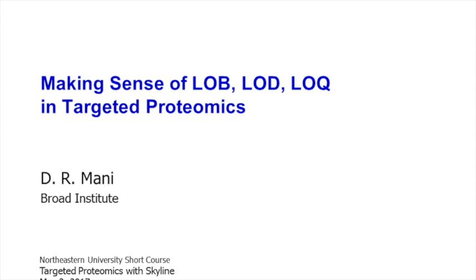So I'll start off by saying that I am not an expert on LOD, LOQ or detection methods and things like that. I kind of ran into this project when we were working on Study 9 with Sue. I think she's presented other parts of Study 9. During the process, I was corralled into an office and told, you need to calculate LOD and LOQ for all these peptides. So I hobbled through what literature there was and tried to figure out what methods people used.